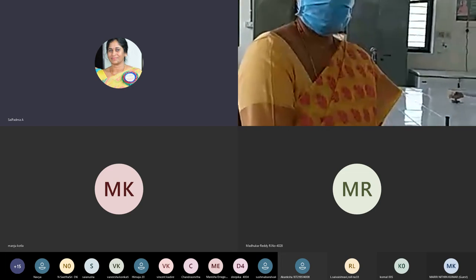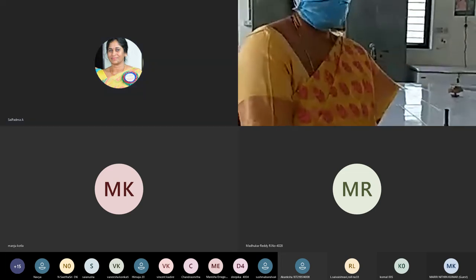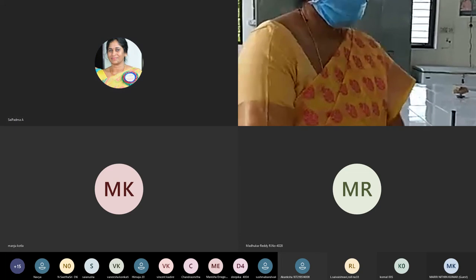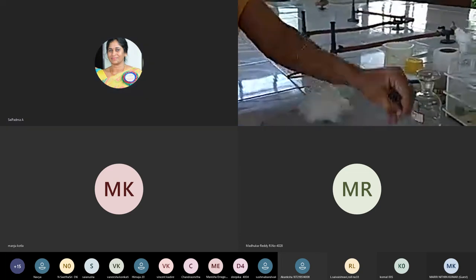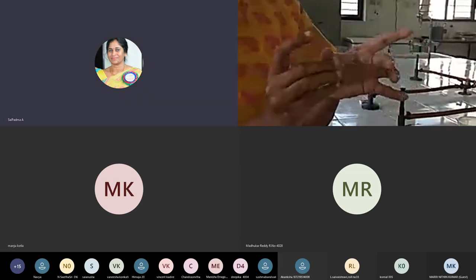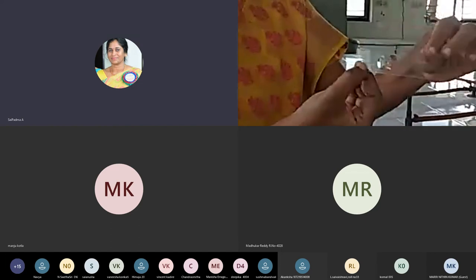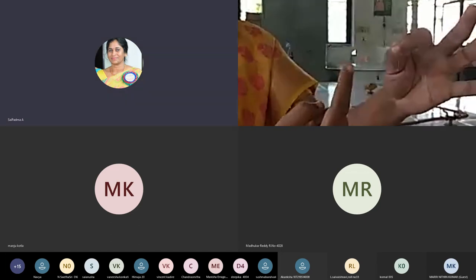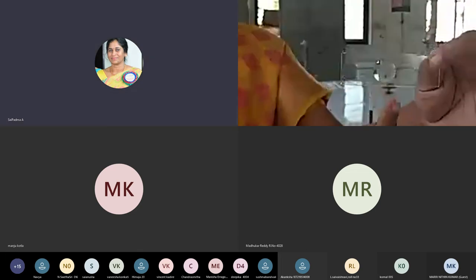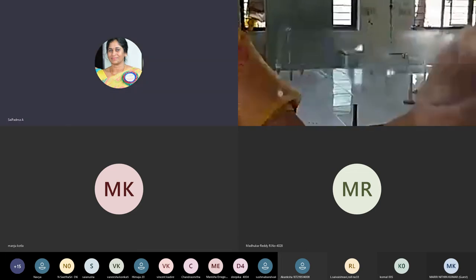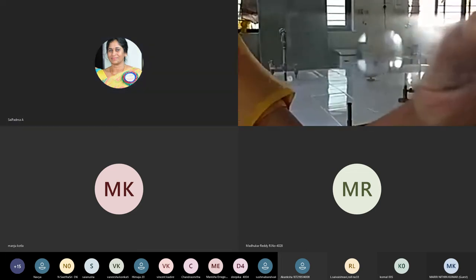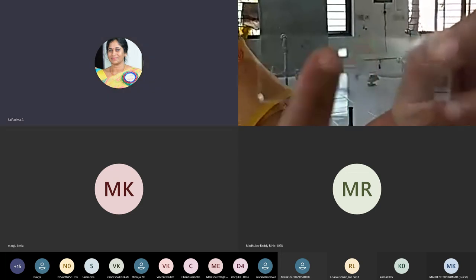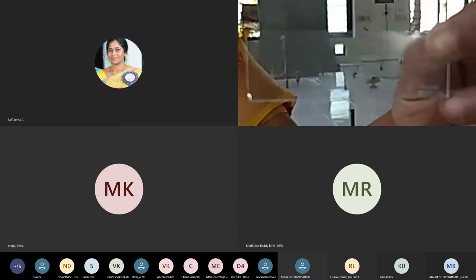In this demonstration of motility of bacteria by hanging drop method, the requirements are first shown. The cavity slide has a depression in its center — this is the type of slide used for the hanging drop. When a finger is placed near it, the gap of the depression can be observed.